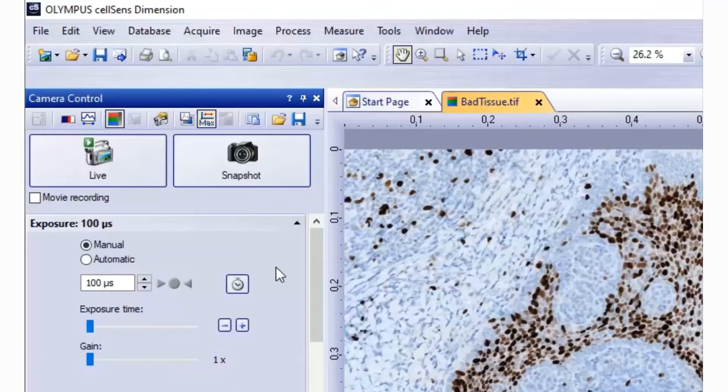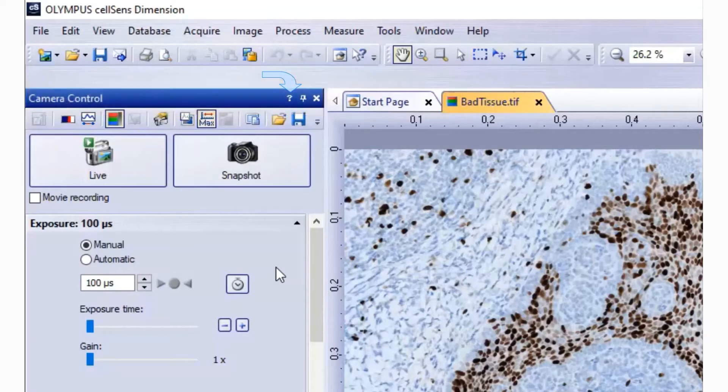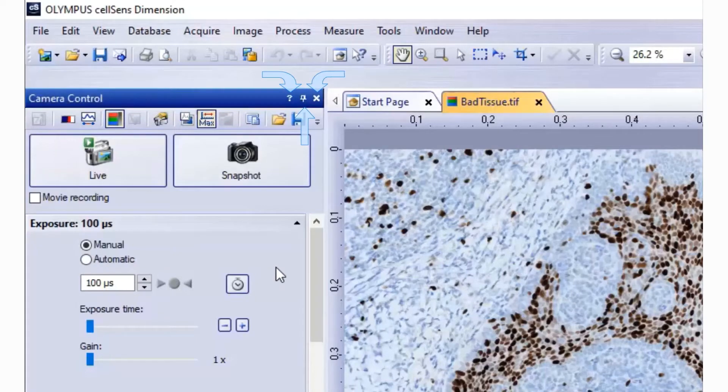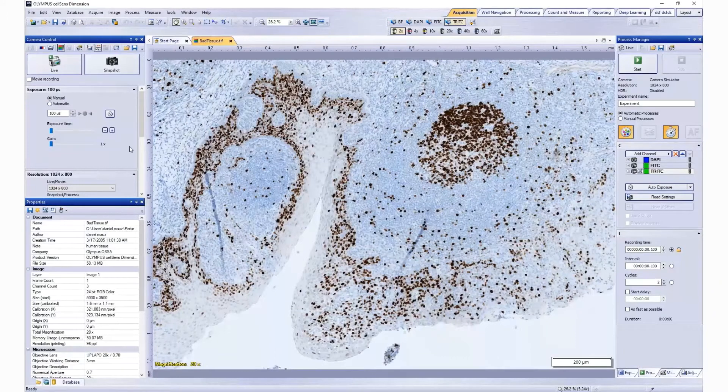The top part of every tool window is called the header. In the header, you will find three buttons: Help, Auto-Hide, and Close. To close a tool window, just click on the Close.